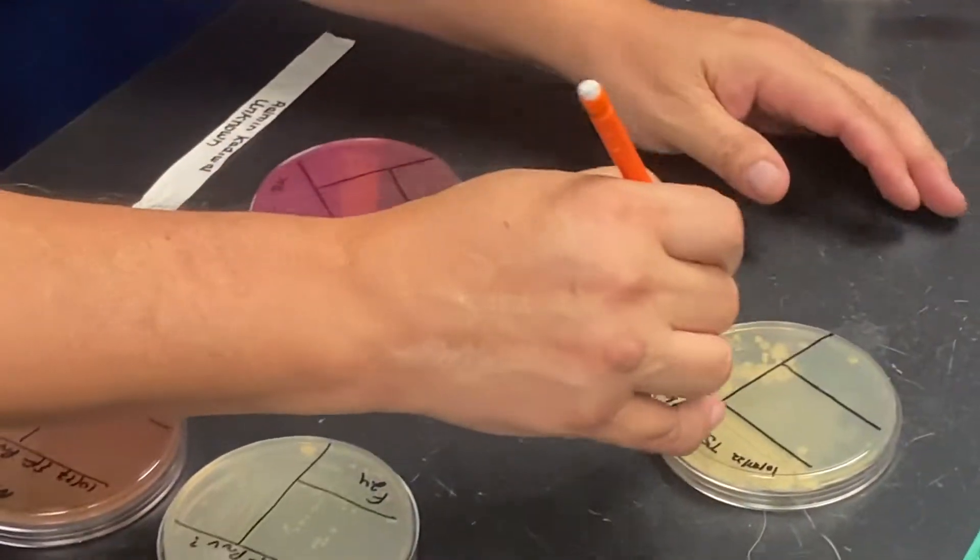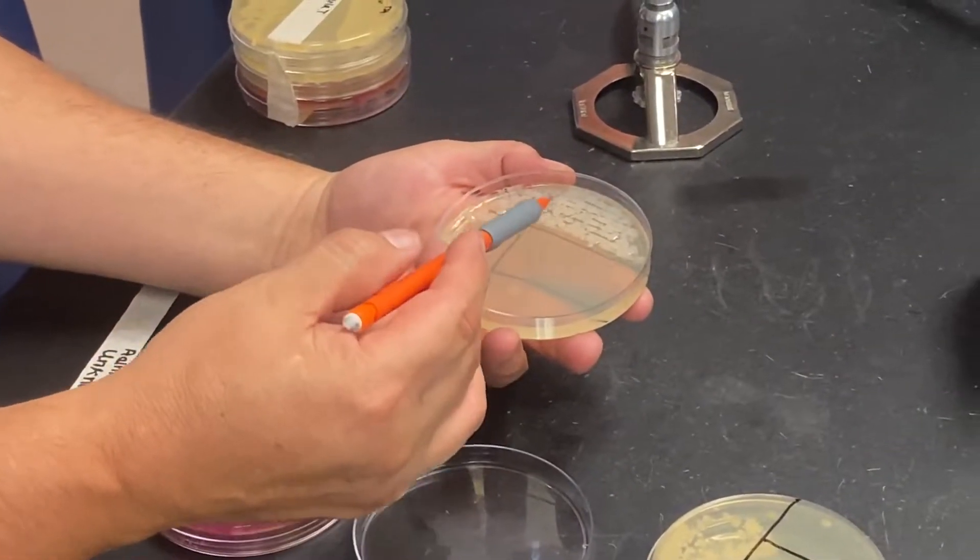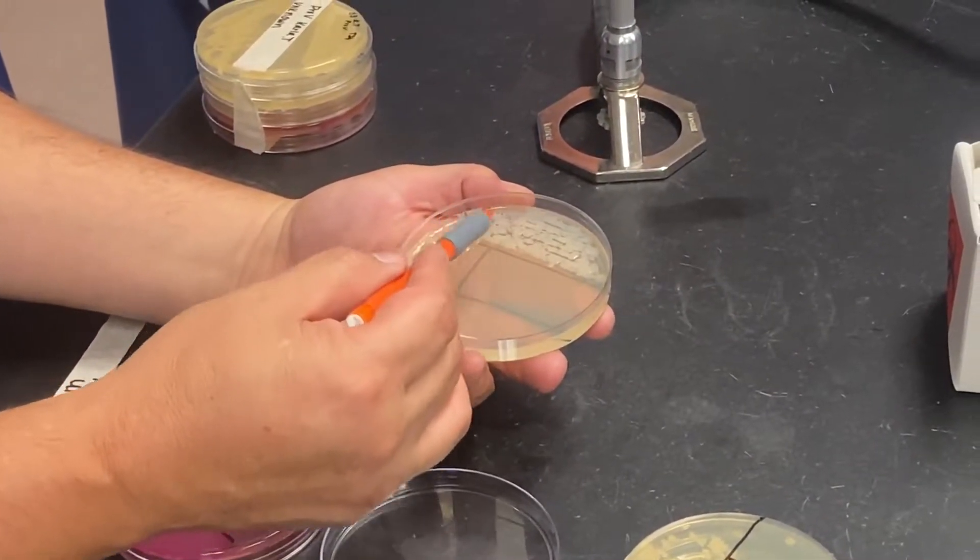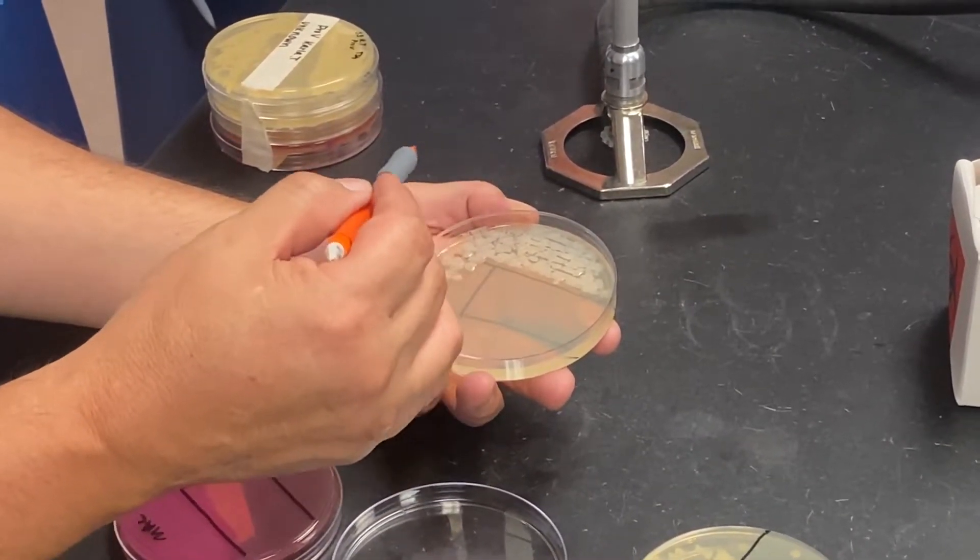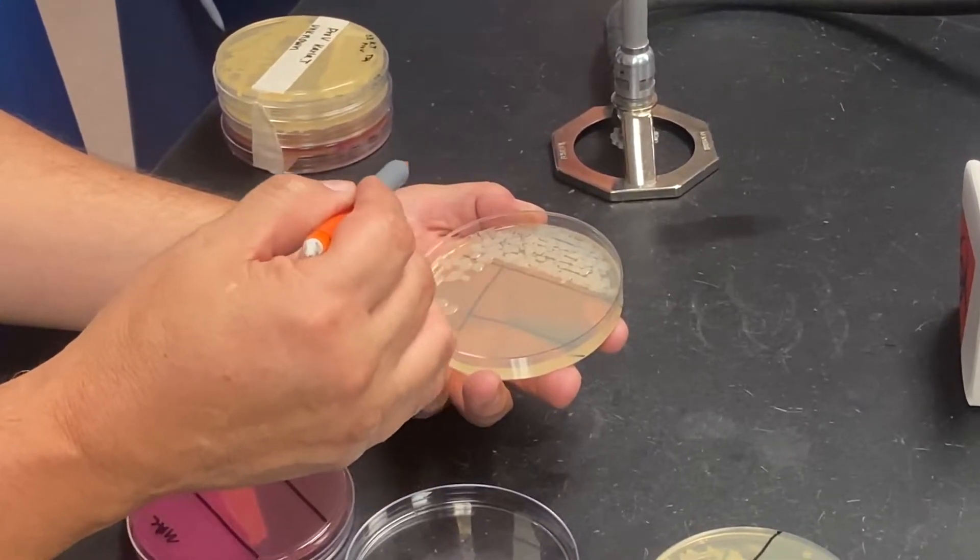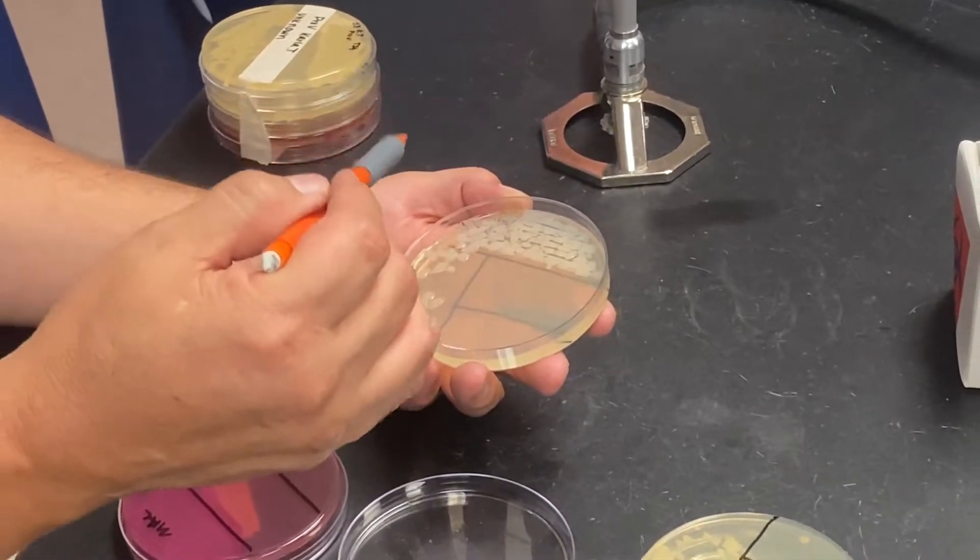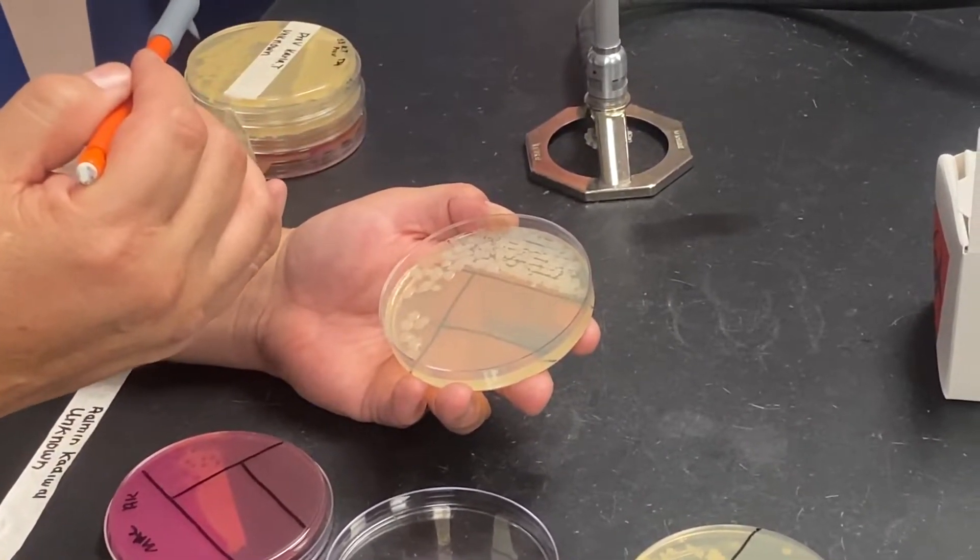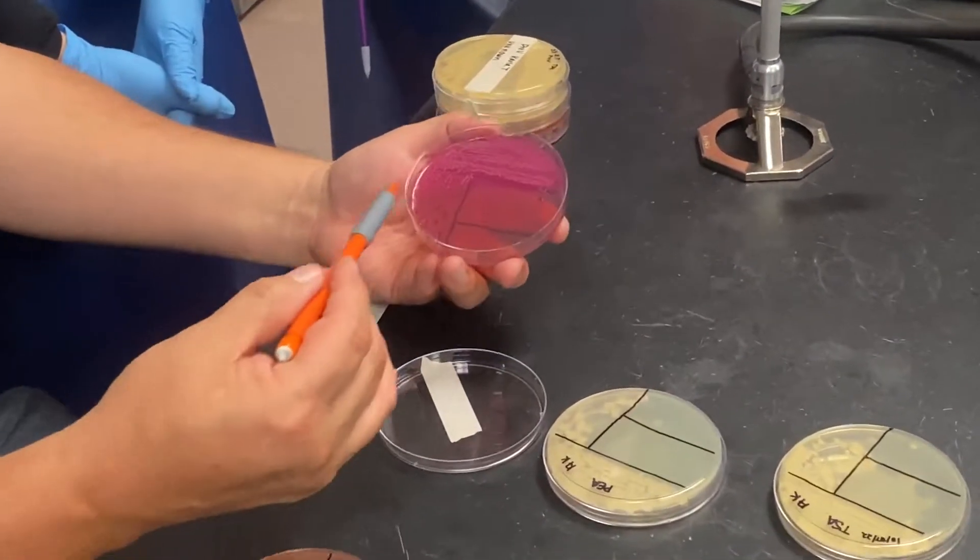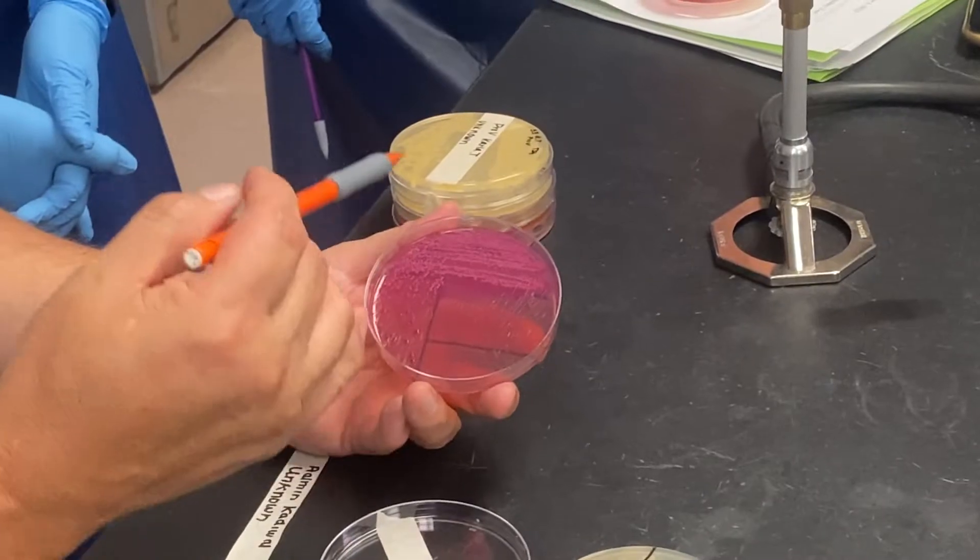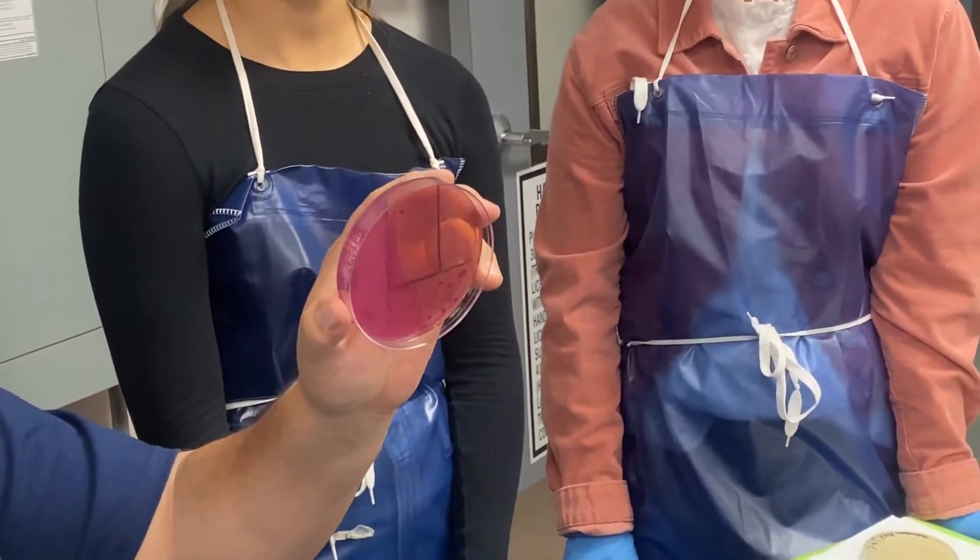Now if I compare that TSA that grows everything to PEA, I'm mostly seeing now this real crusty looking dude that looks mucoid also. It's interesting how its morphology is changing over a period of time. There's a reason I selected this organism because Alamine needed a challenge in her life. But you'll notice here that this organism is growing on McConkie and is it a fermenter of lactose or a non-fermenter? Fermenter.